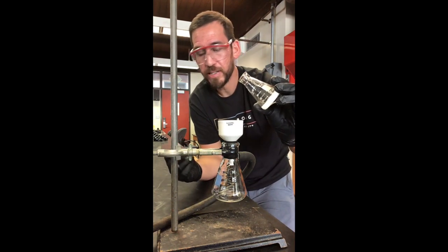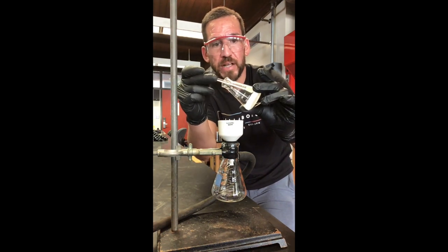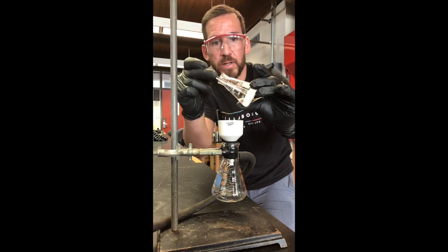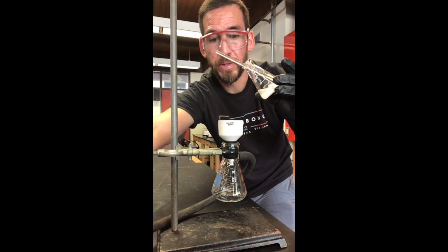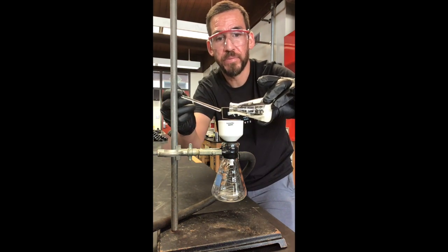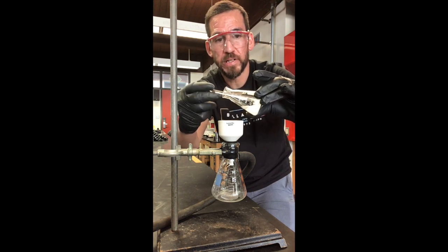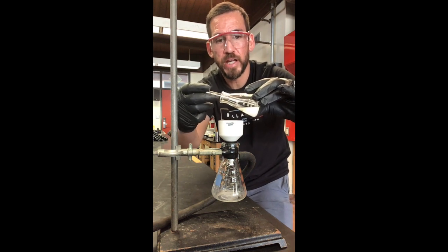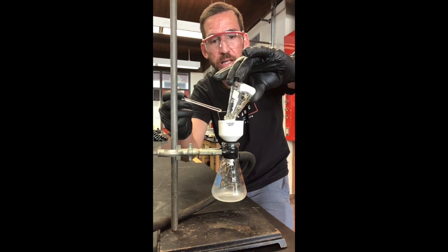But now I'm going to take my glass stirring rod, or whatever I have, and break up that solid material, and I'm going to pour the rest of it, okay? So I'm going to turn this vacuum on. I basically wet it already, and so now the filter paper is suctioned to the Buchner funnel, B-U-C-H-N-E-R, and now I can go ahead and pour it off very quickly.